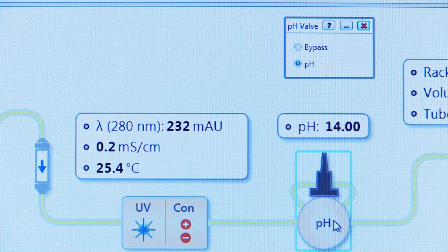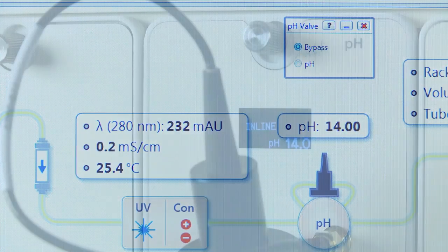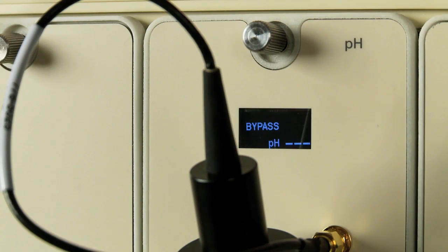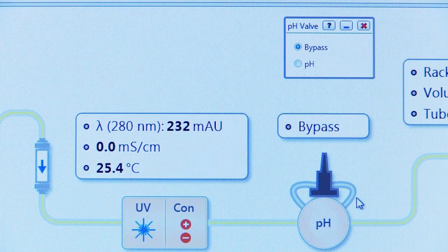Confirm proper operation of the valve by selecting Bypass Position. The pH valve should move to the new position, and the valve diagram should reflect the change along with an audible click.